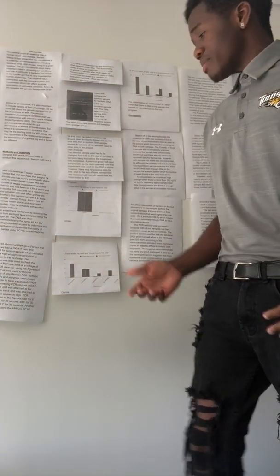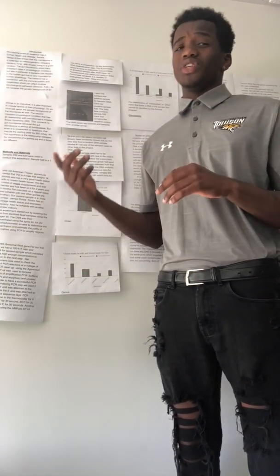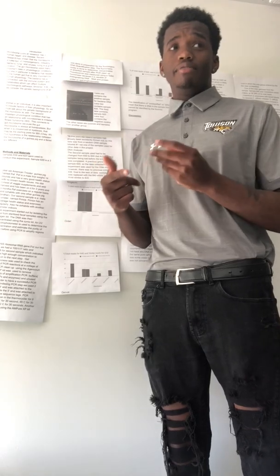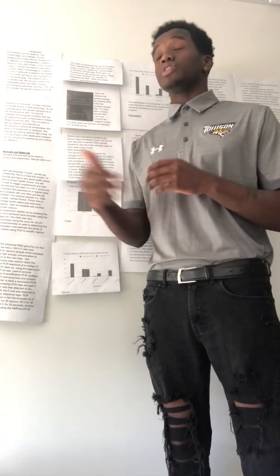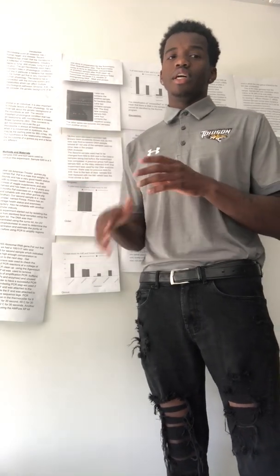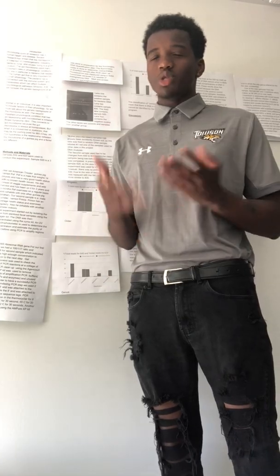So now I want to compare both animals. Sample 620 had 20,694 reads, and sample 840 had 13,423 reads, and both numbers were far above the amount of reads needed, which is about 1,000.